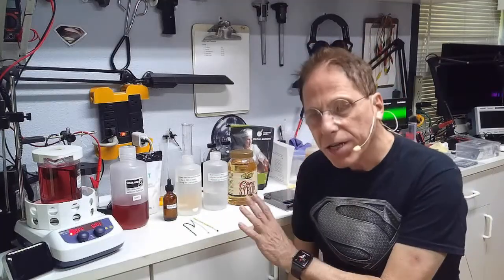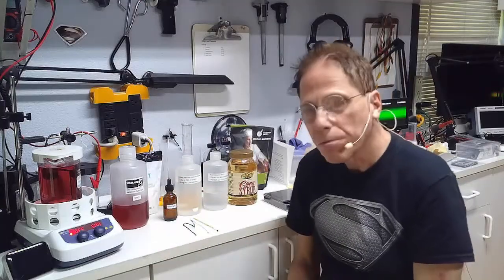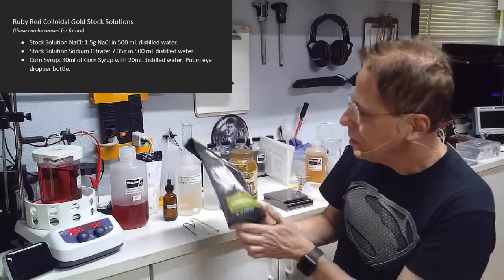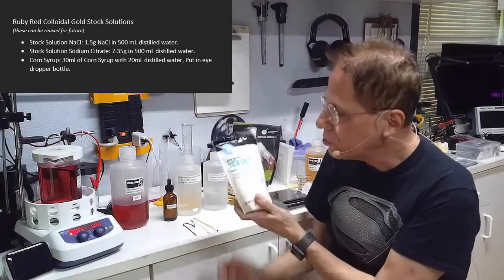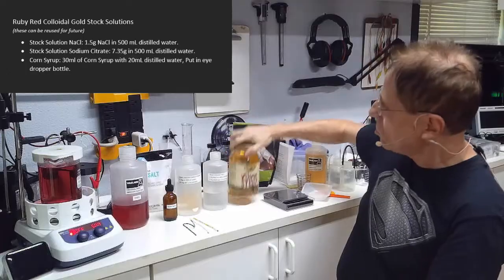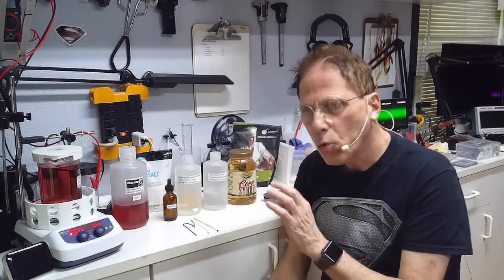The next part of the process is making the stock solutions. To create colloidal gold we have to add certain chemicals to get the proper gold that we want. Those chemicals are kitchen-friendly household chemicals: sodium citrate, NaCl (sea salt or table salt — no iodine, do not get salt with iodine), and corn syrup.